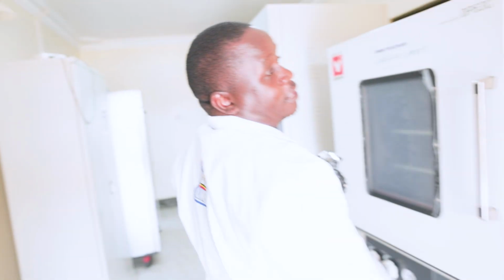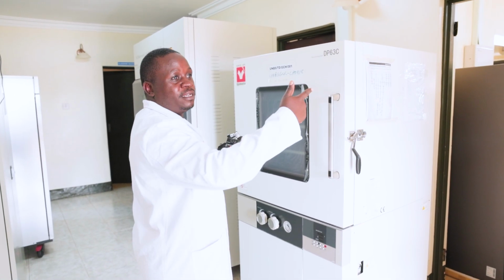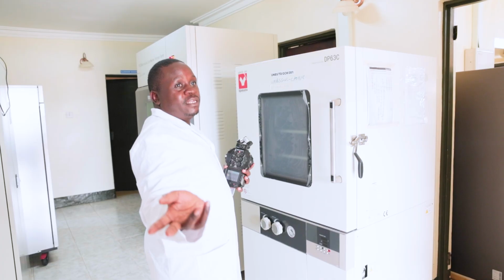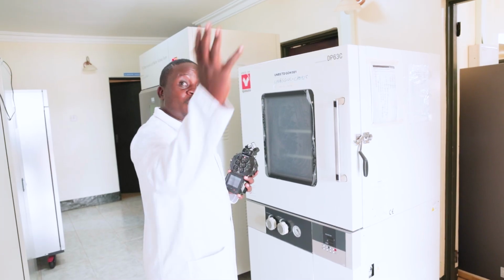In oil there is water. You don't believe that in oil there is water. So when we are doing water content, you see after processing, oils have a lot of acids and all that. So they put in sodium hydroxide to try to neutralize it, and then wash out that sodium hydroxide. So they use water to wash.